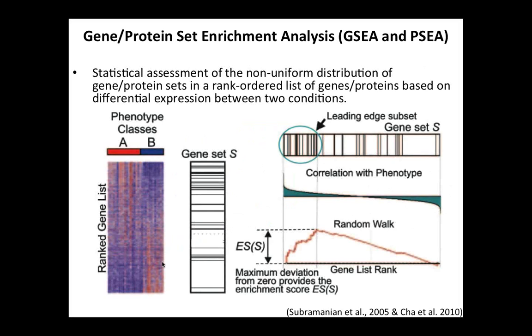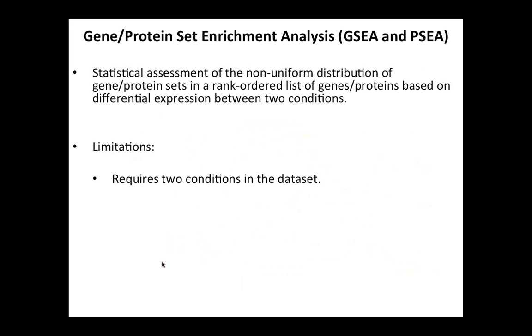And so this approach is extremely popular and was extremely well received, but it has a few drawbacks and a few issues when we try to apply it to proteomics. The first one is that it requires two conditions.